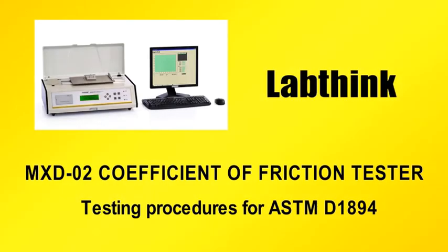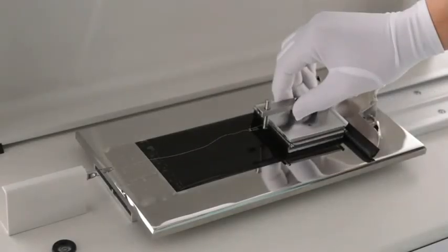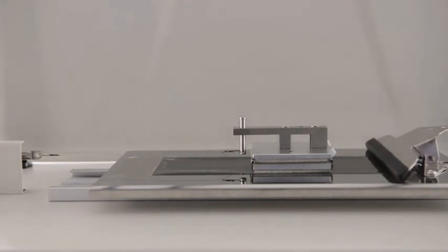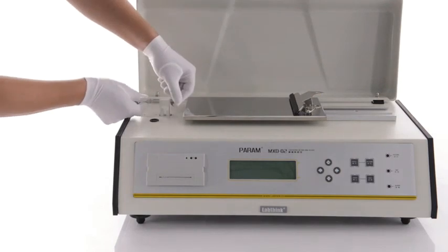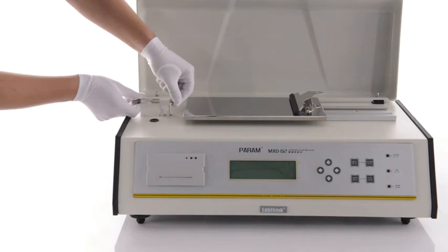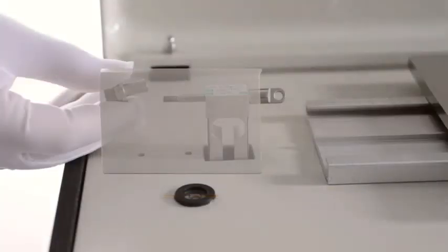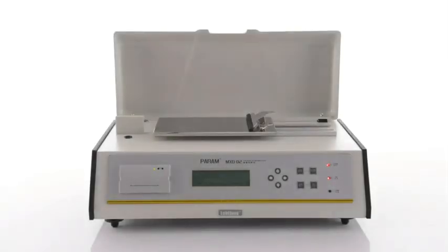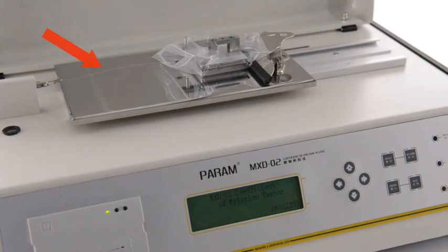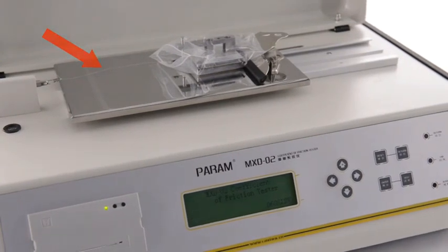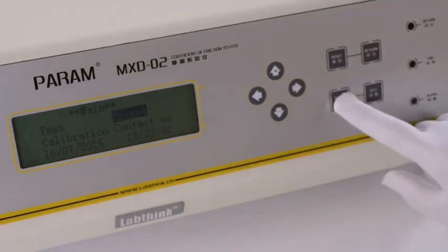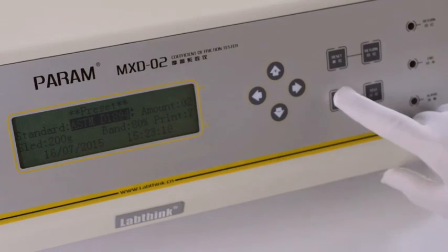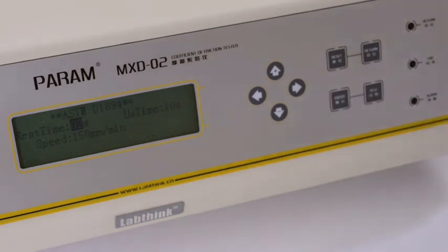Testing Procedures for ASTM D1894. The operation is basically the same as that of GB10006 and ISO8295. Insert the provided sliding rod into the eye screw of the load cell. Screw the spring holder to the sliding rod from the other side of the load cell. The sled and load cell are connected with the nylon filament. Press Enter to enter the preset interface, select standard ASTM D1894. The speed will be 150 mm per minute.